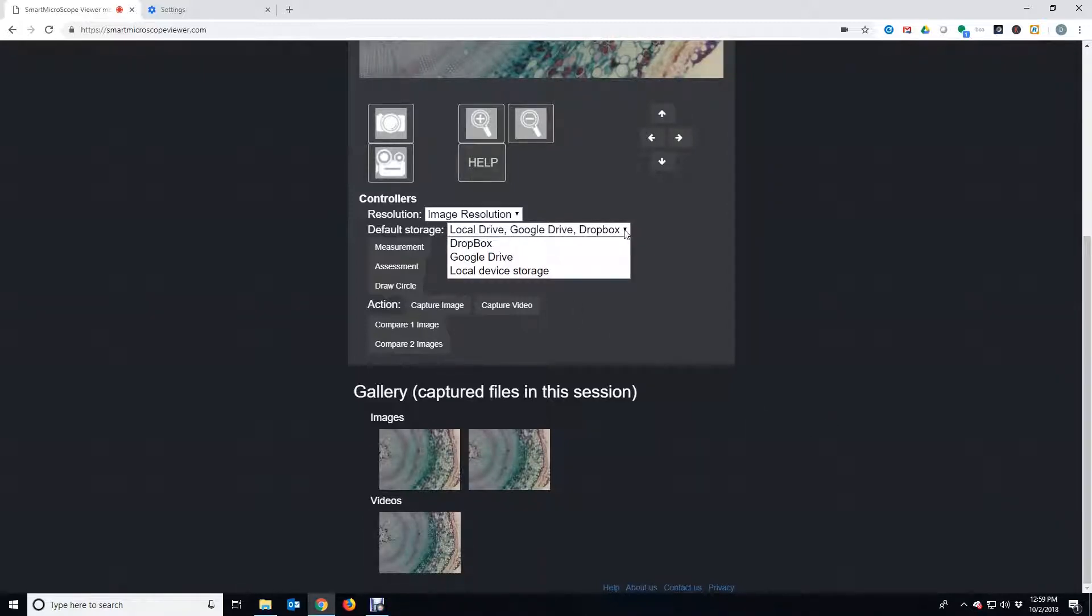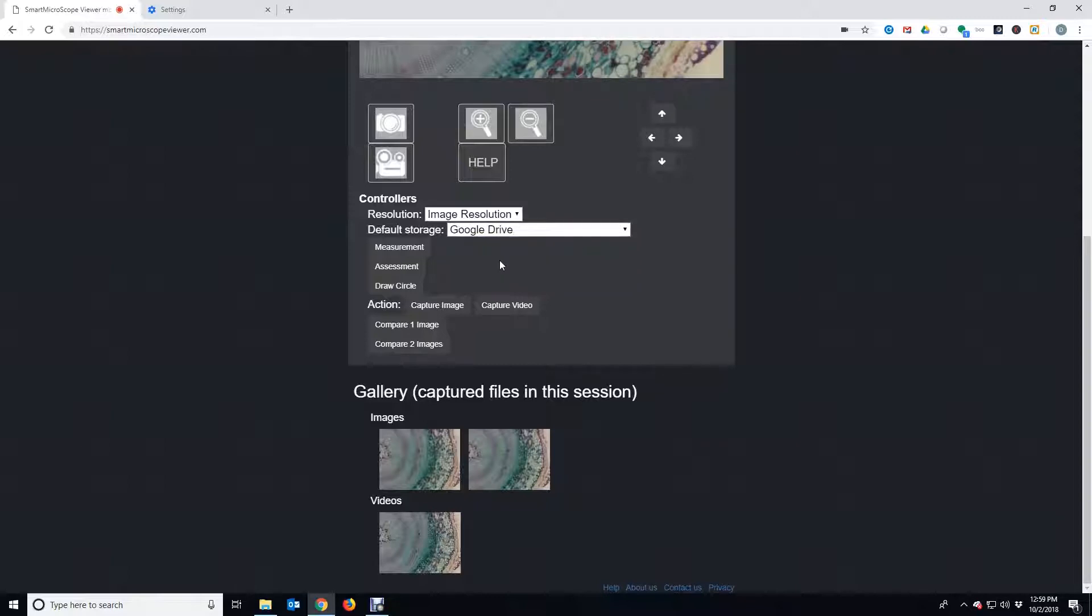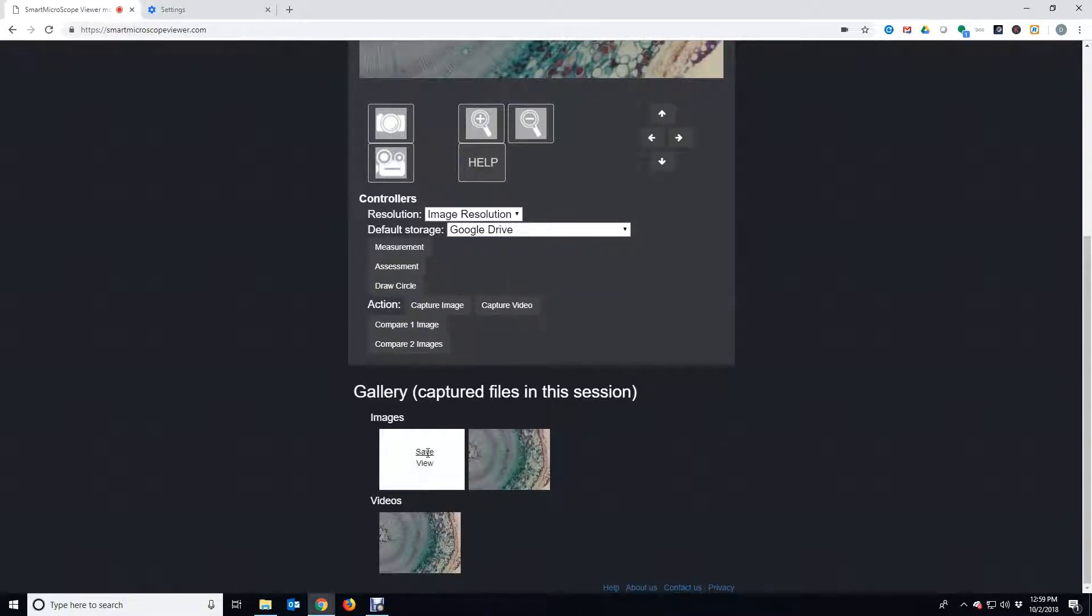There are three save options. We will choose Google Drive. This will save the images and videos directly to your Google Drive.